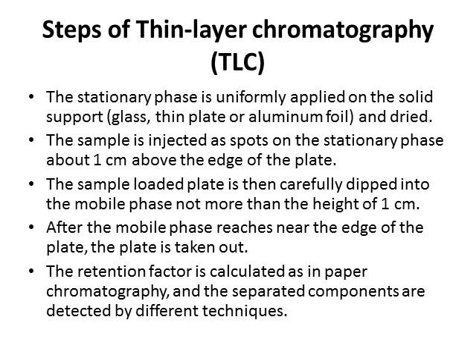The stationary phase is uniformly applied on the solid support. It may be a glass or a tin plate or aluminium foil and dried. The sample is applied as spots on the stationary phase about 1 centimeter above the edge of the plate.